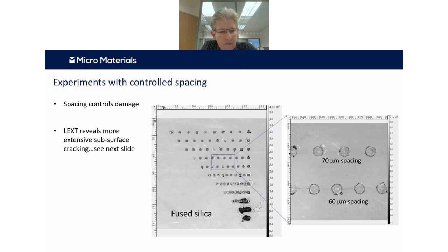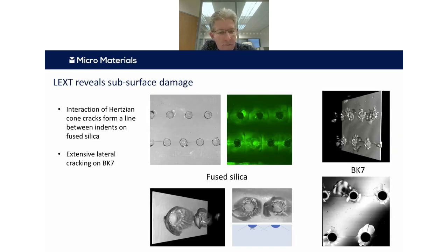And we're starting to get, by 60 microns apart, a few of these cracks joining up. So this is the contrast image. We're also at MPL, they were looking at the green light images, and that reveals a little bit more about what's going on.